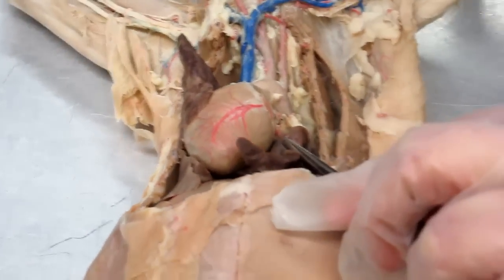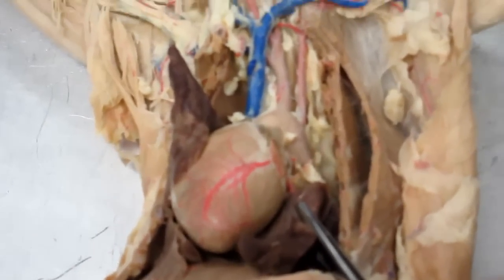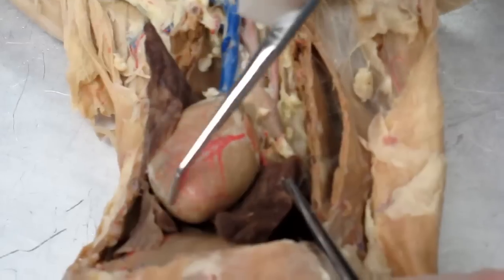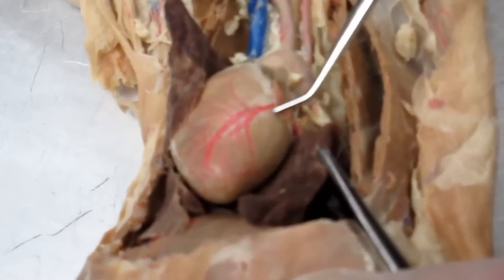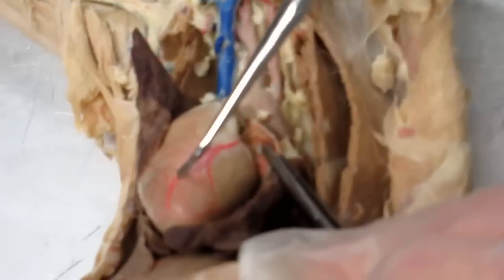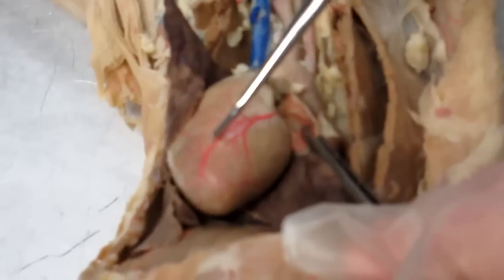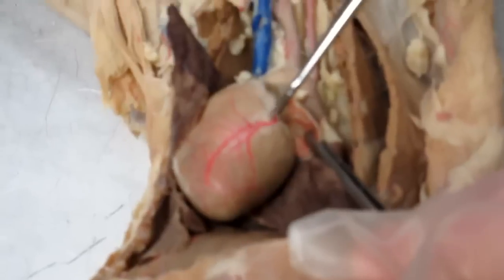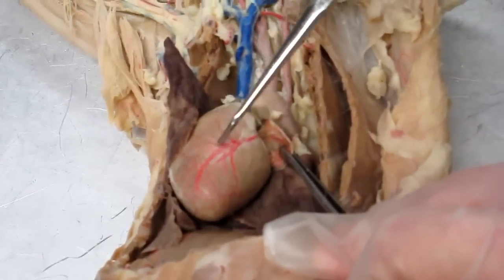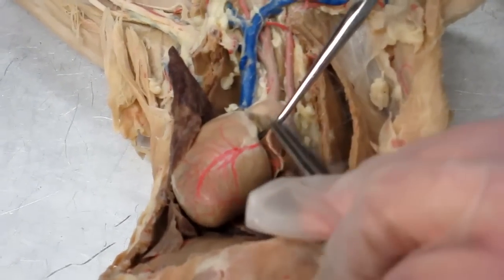Okay, so we're going to go through the cat vascular system. I'm going to start with the arterial system, and we'll start here at the heart. You can see there's a really nice branch of the left coronary artery that's labeled on this particular cat. You can see that this is specifically the anterior interventricular artery, and you can see many of its smaller branches here, which is really nice.